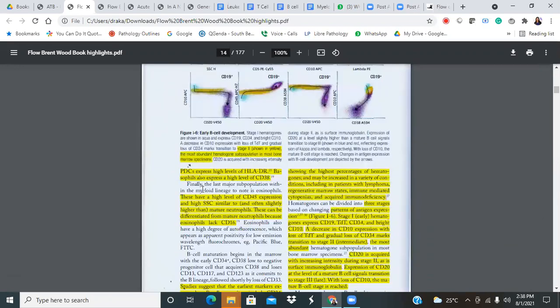Yeah, so we also, like you said, there are some aberrant markers too, like CD58 and CD133. We will discuss more into that when we do B-ALL, but just because you asked about markers, we do have some markers that can help. Right.